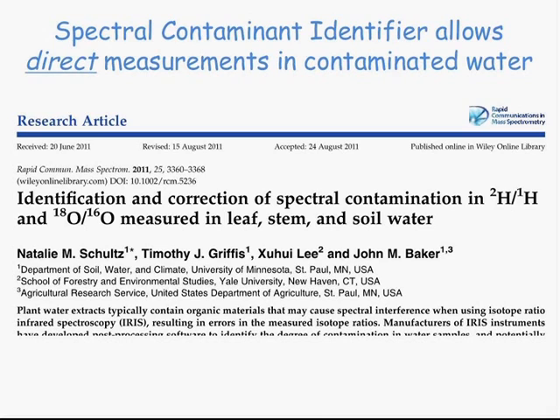Our newest instruments are temperature stabilized and they are heated, so you wouldn't expect any condensing inside the instruments at 30,000 ppm. But researchers would need to be careful with getting the vapor stream into the instrument, so that condensing didn't happen between the source and the inlet to the instrument, as of course condensing would cause large errors in isotope ratios. Okay.